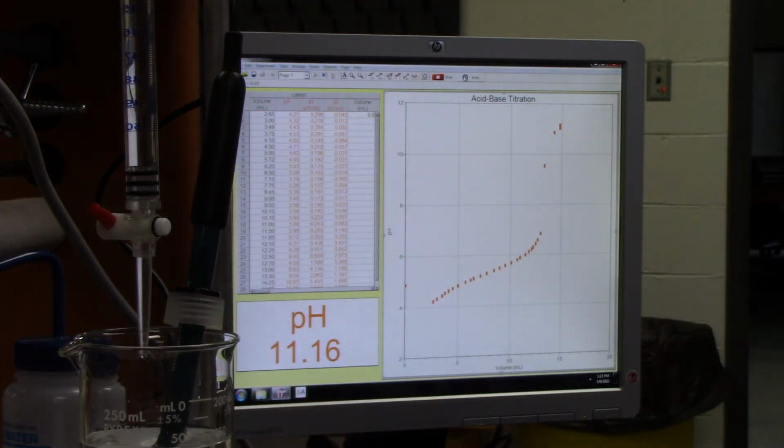Okay. Now you see that the pH is slowly changing.